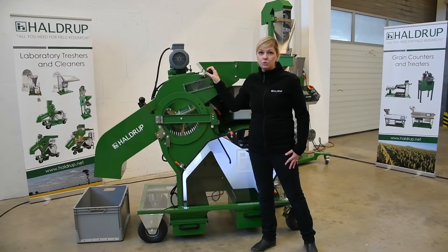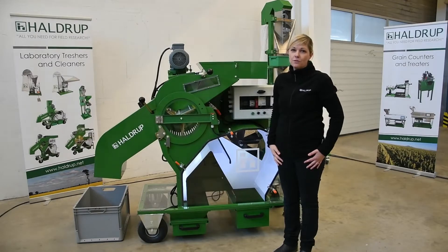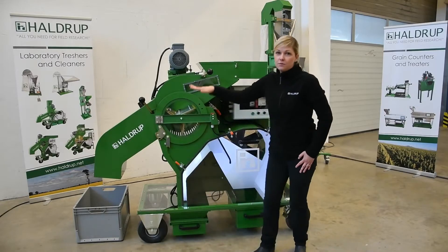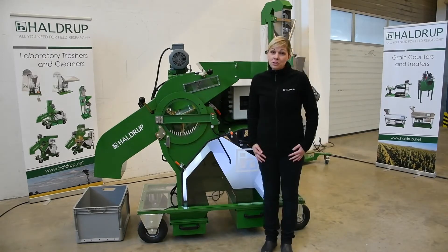We also have the possibility to do the packing at an ergonomic height, because before it was always necessary to go down and open the boxes if the machine was not at a comfortable ergonomic height. This machine is very flexible and very universal. We can use it for different types of materials, such as vegetables up to corn. Now we will demonstrate how this machine works.